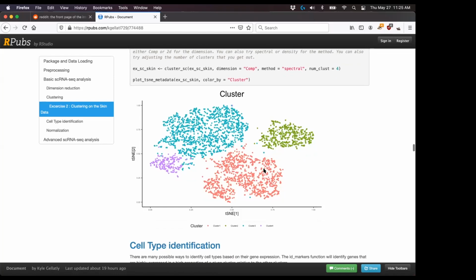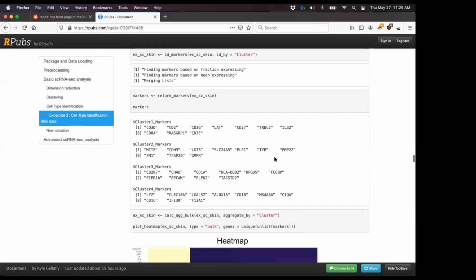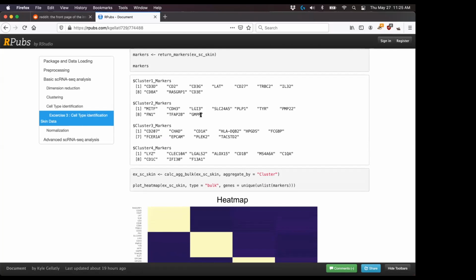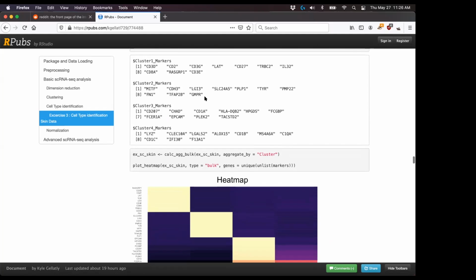So what you might end up doing a lot of the time is doing an initial clustering and getting coarse-grained cell types. Then you might take only these red cells, only these T cells, and redo this process in order to find variance that separates out the T cells alone, as opposed to what distinguishes each cell type. A lot of the time it will be an iterative process where you cluster, you get coarse-grained cell types, and then you take each one of those cell types and reprocess them on their own and do further clustering in order to separate that cell type out into its components.